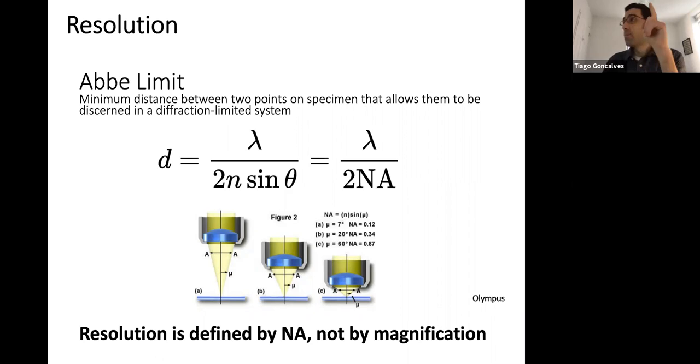Theoretically, yes. But empirically, when you go and measure, and for different reasons that have to do with matching the aperture of the objective with the aperture of the microscope, lower magnification objectives actually achieve a higher resolution than higher magnification objectives, which is counterintuitive, but that is the point. So take-home message: your magnification doesn't mean that you're better at discerning small things. Your numerical aperture is what matters. And of course, the wavelength that you use to image.